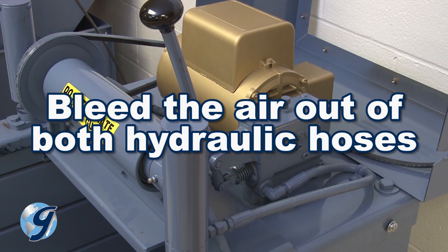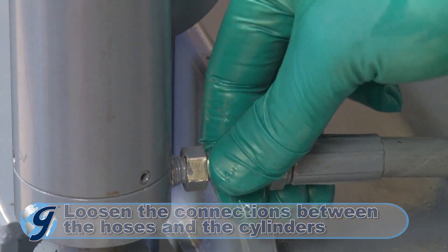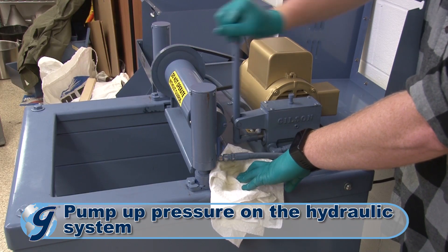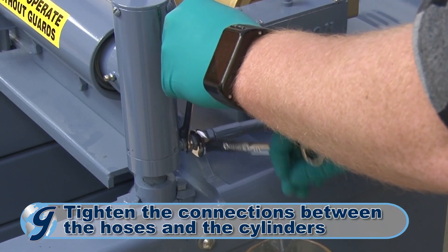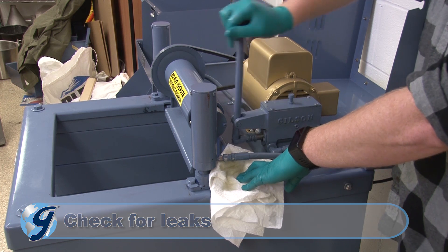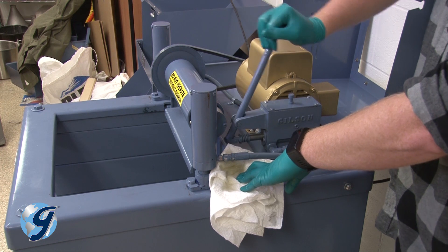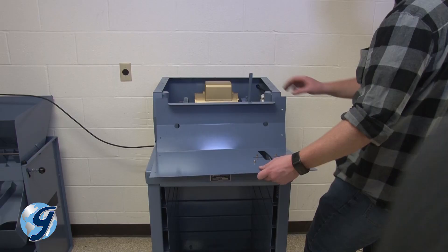Now, we're going to bleed the air out of the hydraulic system. Loosen the connections between the hoses and the cylinders by unscrewing the swivel connections slightly. Pump the hydraulic system until the oil appears at the loosened connections. Now retighten the swivel connections. Once tightened, pump the hydraulic system to confirm that all the fittings are free of leaks. If the fittings leak, use hydraulic joint compound to create a seal between each leaky fitting and the pump or cylinder to which it is attached.